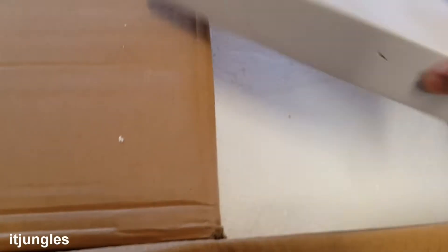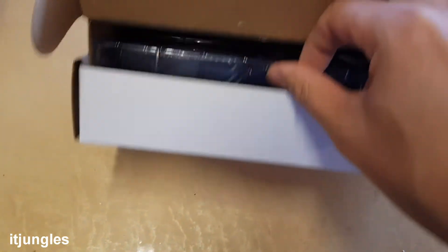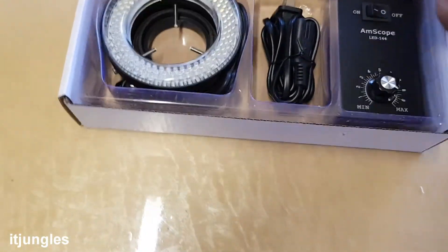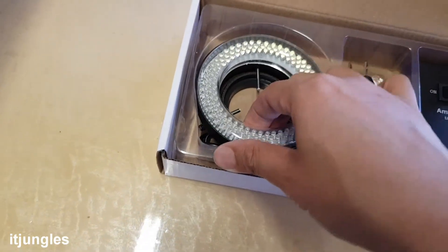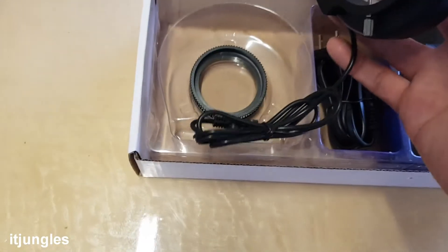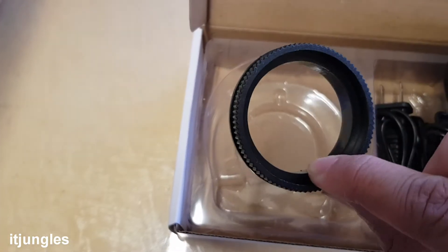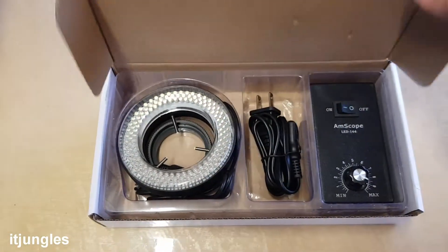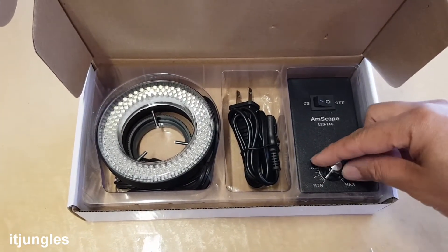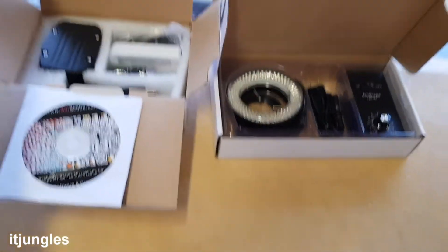Okay, here we have another box. Just going to put it on the table. There are some controls and power cables, and then we have the light — the 144 LED light. That part there is a plastic ring and there are some mounting rings. So this box is the lighting and the power control.